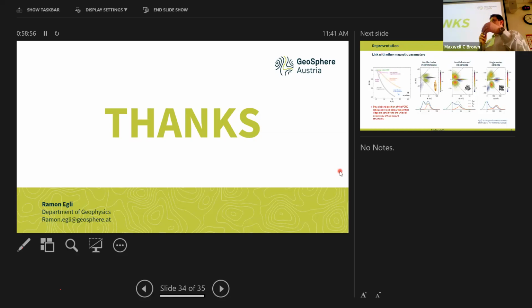But take a high pass of these measurements, and this kind of regular slow change will not appear in the FORC function. Instead, if you change the magnetization of the sample within a packet of 5 curves, 5 curves is something that is captured by a smoothing factor of 5. So over 5 curves, you have a change of 1 degree Celsius. This is going to be captured incorrectly by the FORC function, and it creates your diagonal story.